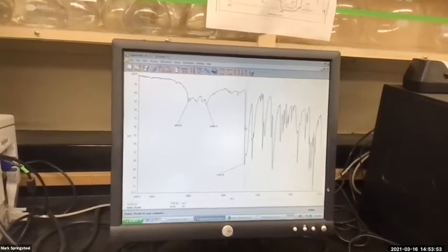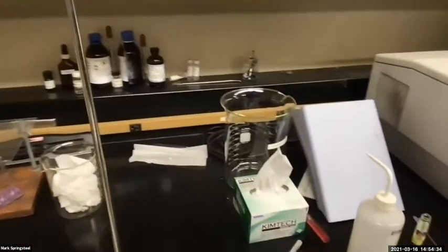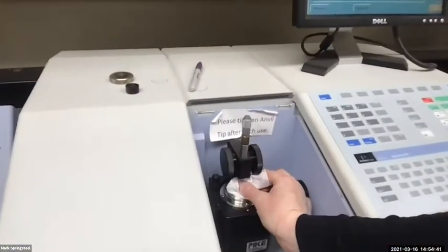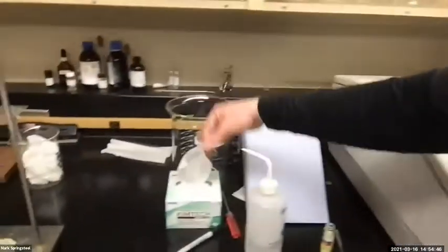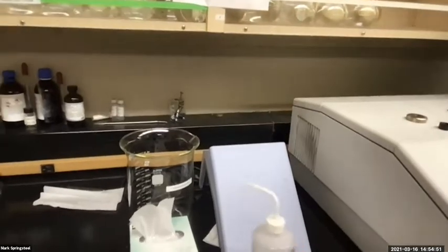Is this benzil? I don't think it is. I'm going to take a picture. Here, I'll show you how I clean it off. Wet it a bit, and pick up most of it. I think it might be benzil and something else.